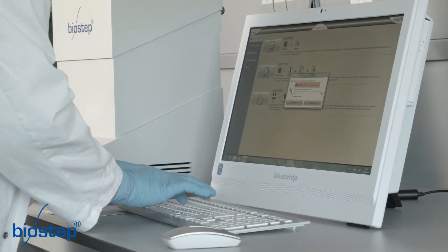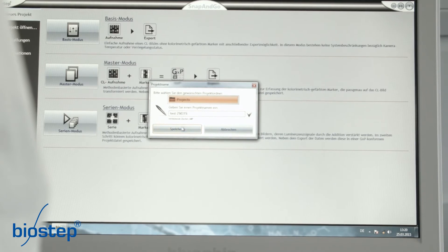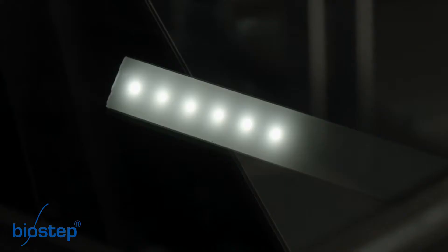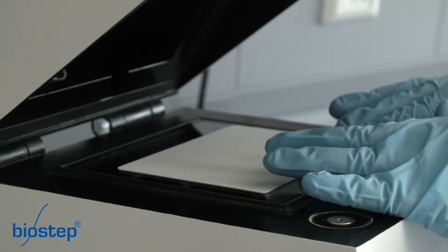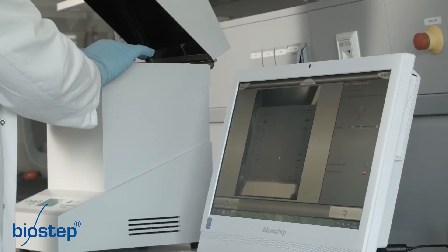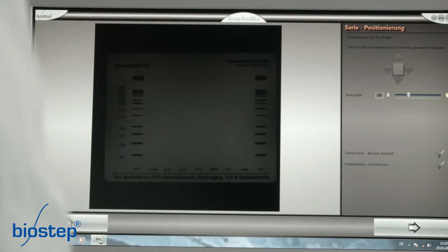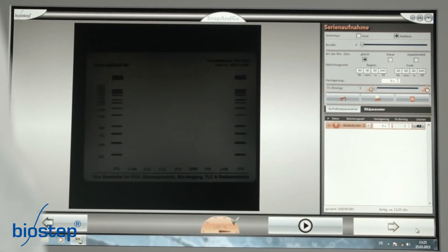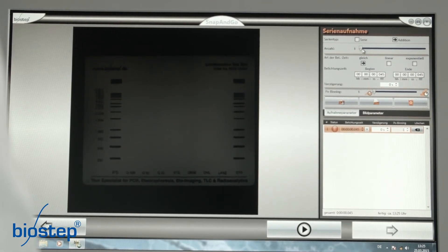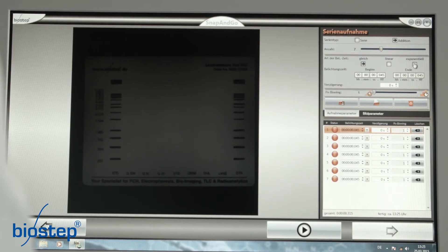First, choose a name for the project as well as the folder for saving. The program starts in the live image mode with LEDs switched on in order to facilitate the correct positioning of the blot. Click on continue. You can select the capturing options now. The exposure time for the images can be constant, linear or exponential increasing.